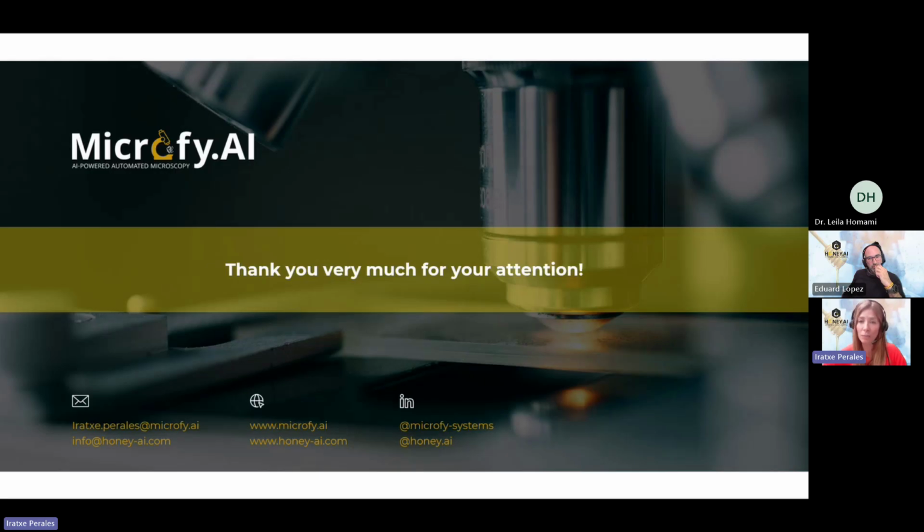It's only 53 because it's what they receive. It's routine analysis for food inspection controls, and because they are the agri-food laboratory Arbitral, the Arbitral only receives the problematic samples. It means that when the other communities in Spain have problems, they send the samples to them. So that's why they only have 53. So they analyze what they received. They are honey samples collected from Spain.